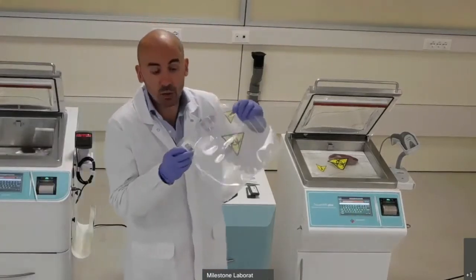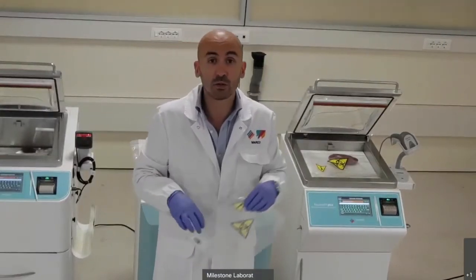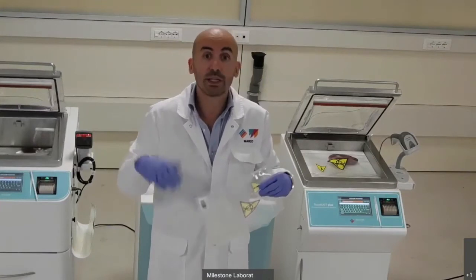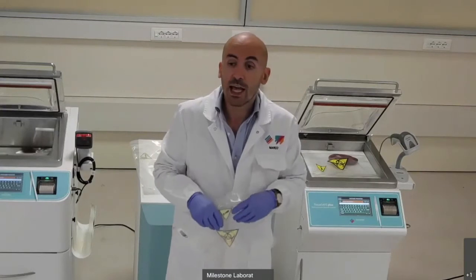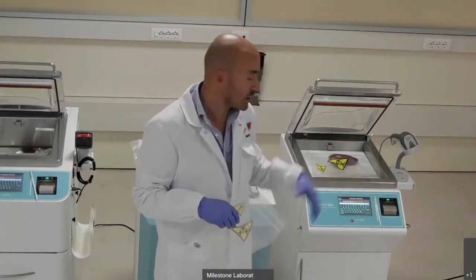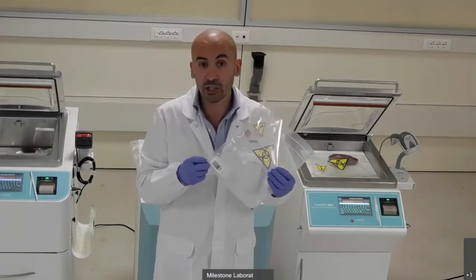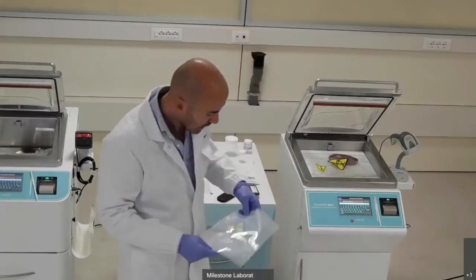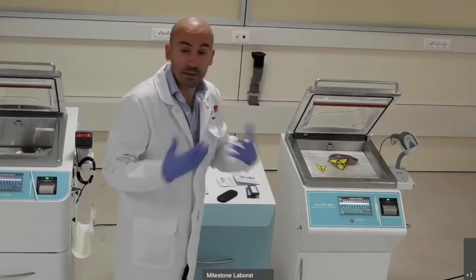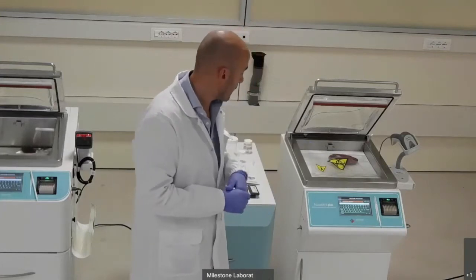On each bag you have a unique barcode. This barcode holds information about the bag size and how many times the bag has been used. After a procedure, like the one I will perform in a few moments, I will have an association between the identification code of the bag and the identification of the patient. For the sake of this demo, I already have a sample inside the bag.